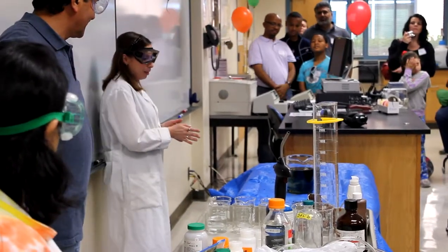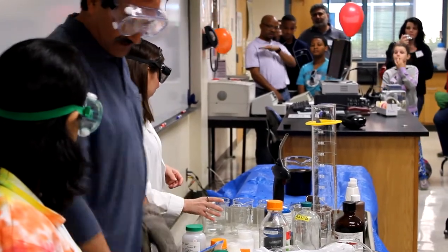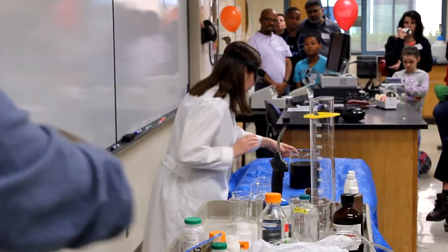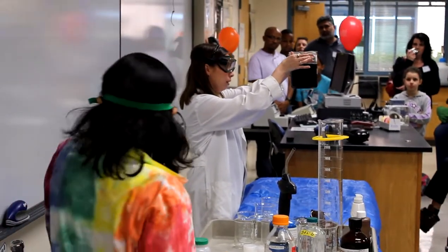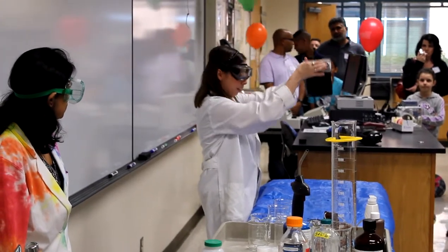It's a little bit on the slow side. So this oscillating reaction is supposed to turn orange, blue, and clear, and it's going a little bit slow today. There it goes. Kind of.